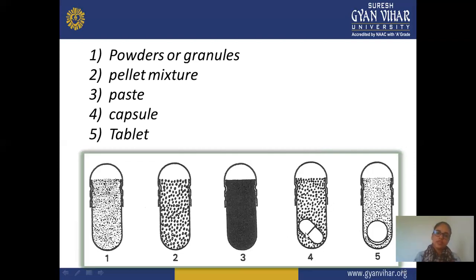In this, you put a capsule, and if this capsule is not sufficient, then you can also use some excipients that don't show any effect, or maybe granules or powder, or maybe you use only the capsule. So this is a capsule containing the hard gelatin shell, or you use a hard capsule, putting a capsule into this hard gelatin body shell, and then apply the cap and close the capsule.